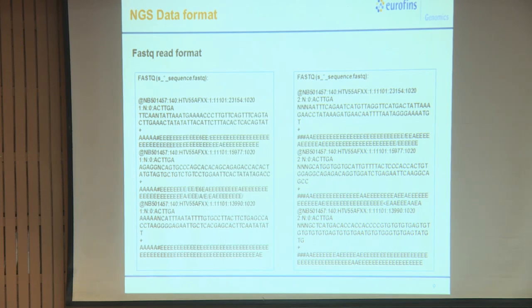If we have 10 samples in one run, I can segregate 10 into 2 files, for R1 and R2, based on these barcodes. And this is my header line, this is my ATGC sequence, this is the strand, and this is the quality of that ATGC.